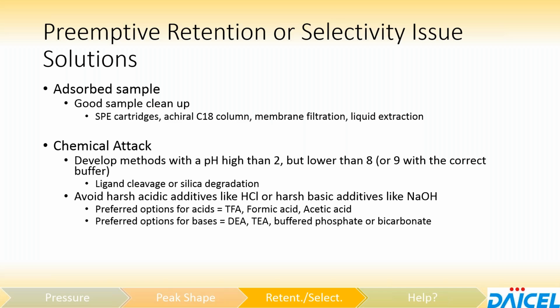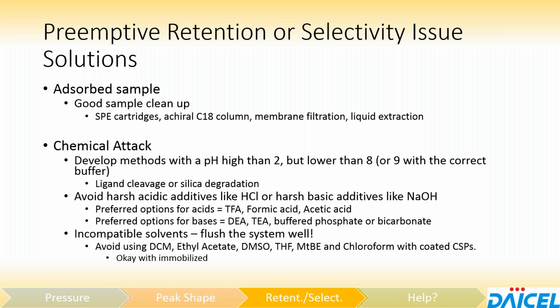Again, much gentler on the column, much less likely to begin degrading the silica as a result of the presence of that additive. And then the incompatible solvents.